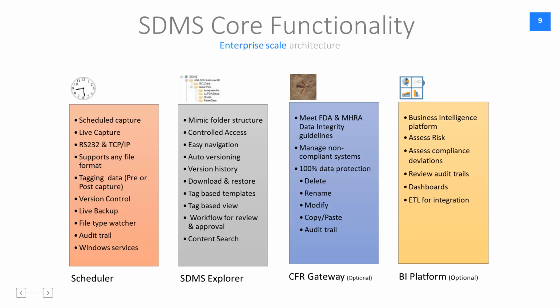Live backup is a very advanced feature of LogiLab SDMS where as and when data is being generated, the system will upload the data to the server.